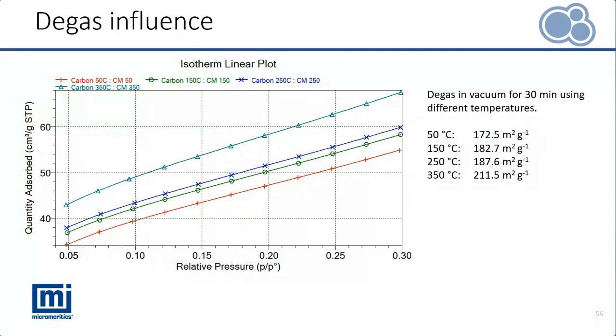The thing is, just from looking at the adsorption results, it is not necessarily obvious whether the right degassing conditions were used or whether the degas was insufficient. Varying the temperature is one way of optimization. Longer degassing times can also be the solution. When working with new materials, I highly recommend taking some time to find the optimal sample preparation conditions for your material.